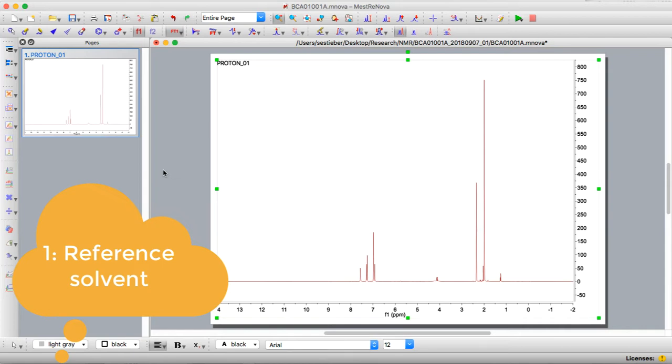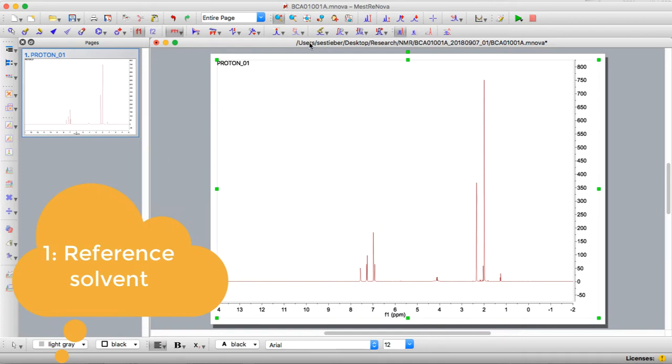This helps you determine where the actual peaks are in relation to whatever deuterated solvent you used. Remember deuterated solvents have a small component of protonated solvent, and so what we're actually referencing to is the protonated component of the deuterated solvent.